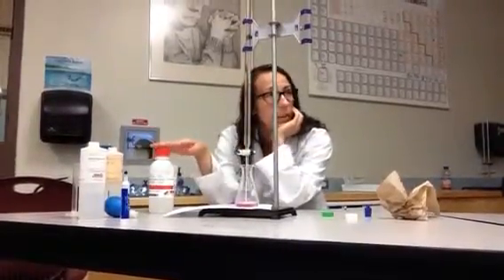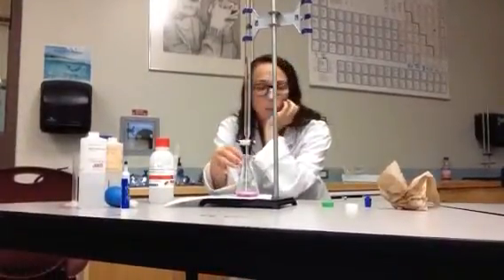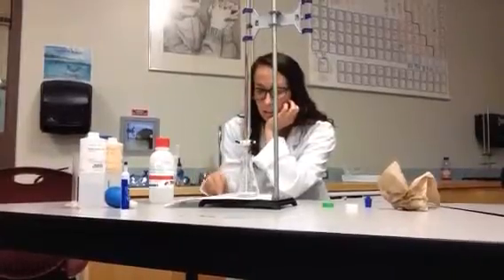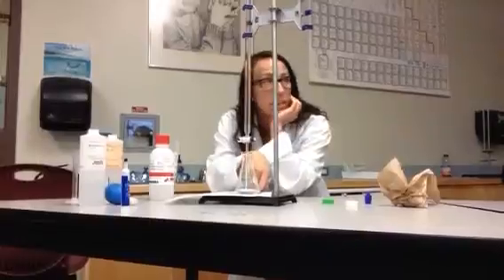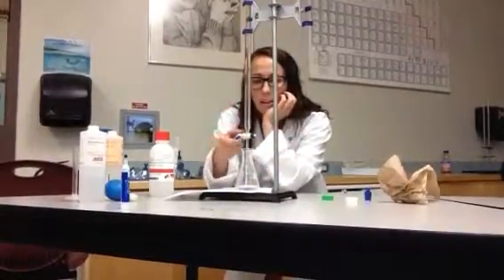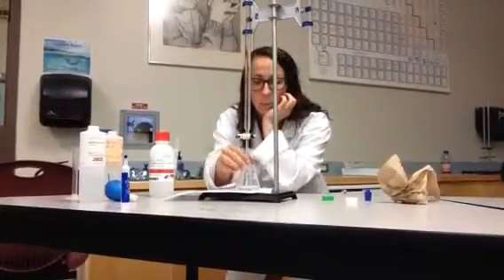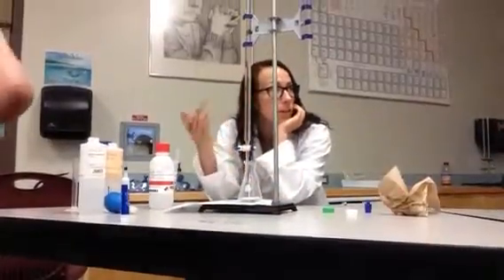Phenolphthalein is pink in a base. And what's pooled right there? A base. Until I stir it, and it's reacted, and the base is all gone. Right now there's excess acid in here, so it's still colorless. Add some base, it's pink there where the base is pooled, mix it up, the base disappears, and I'm just left with salt water and excess acid.